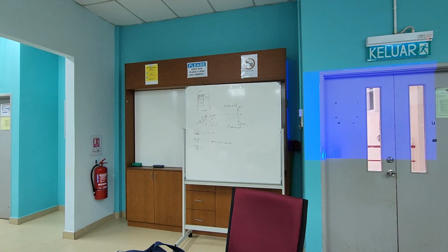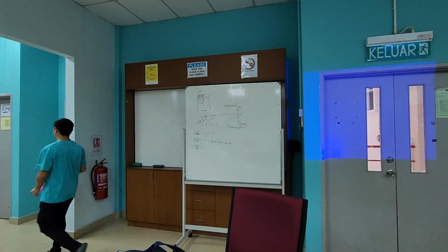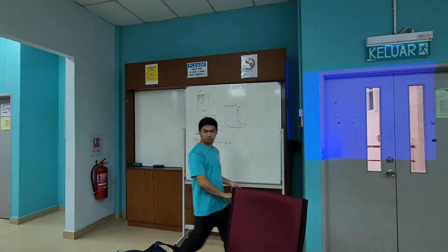Okay, kami. Kalau ada aku suruh dia orang buat kat luar je. Ada lubang? Ini pun ada lubang lah.